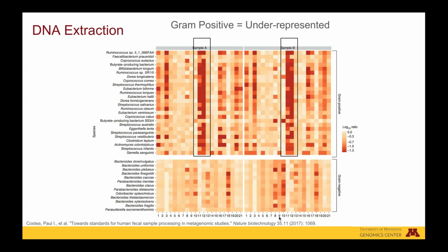And while the authors use this data to recommend a few protocols which offer less bias, we think it'd be helpful to have a tool to assess this bias consistently across labs and samples, and that could potentially be used as an inline process control to track bias across the entire microbiome workflow, including extraction.